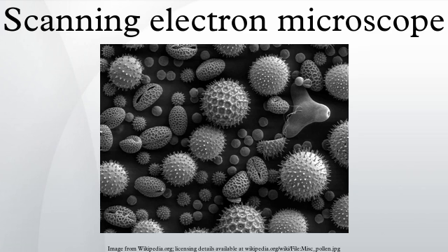transmission electron microscope. The SEM has compensating advantages, though, including the ability to image a comparatively large area of the specimen, the ability to image bulk materials, and the variety of analytical modes available for measuring the composition and properties of the specimen. Depending on the instrument, the resolution can fall somewhere between less than 1 nm and 20 nm. By 2009, the world's highest SEM resolution at high beam energies is obtained with the Hitachi SU9000.